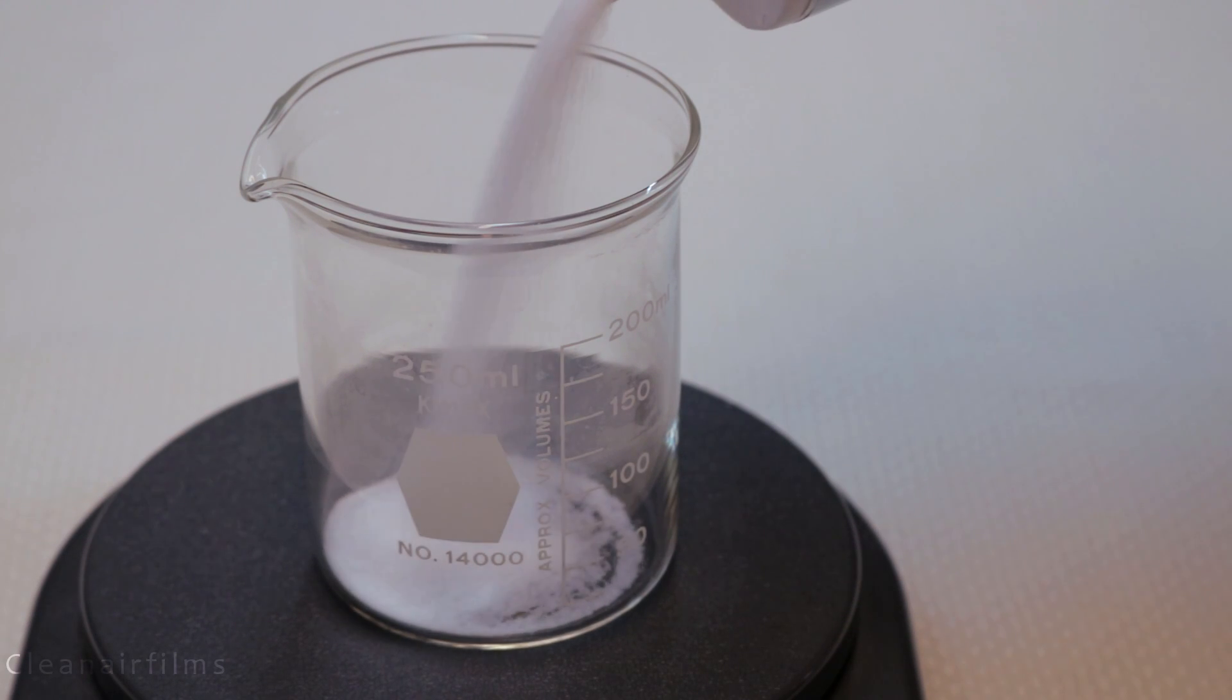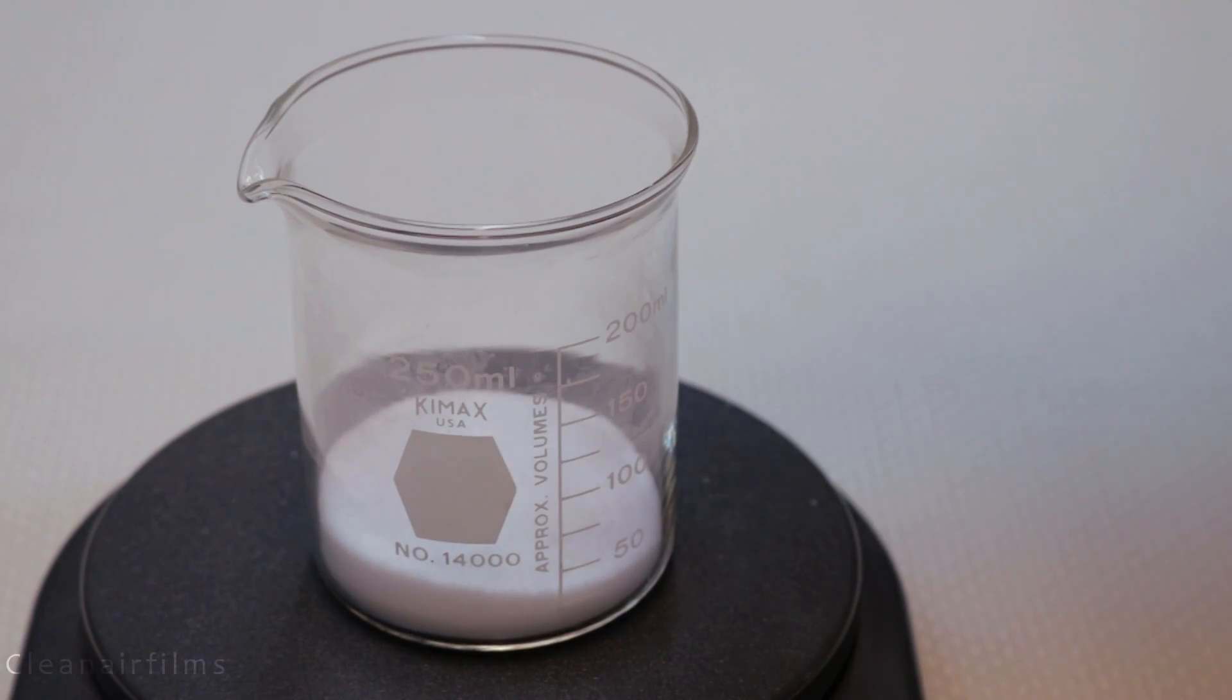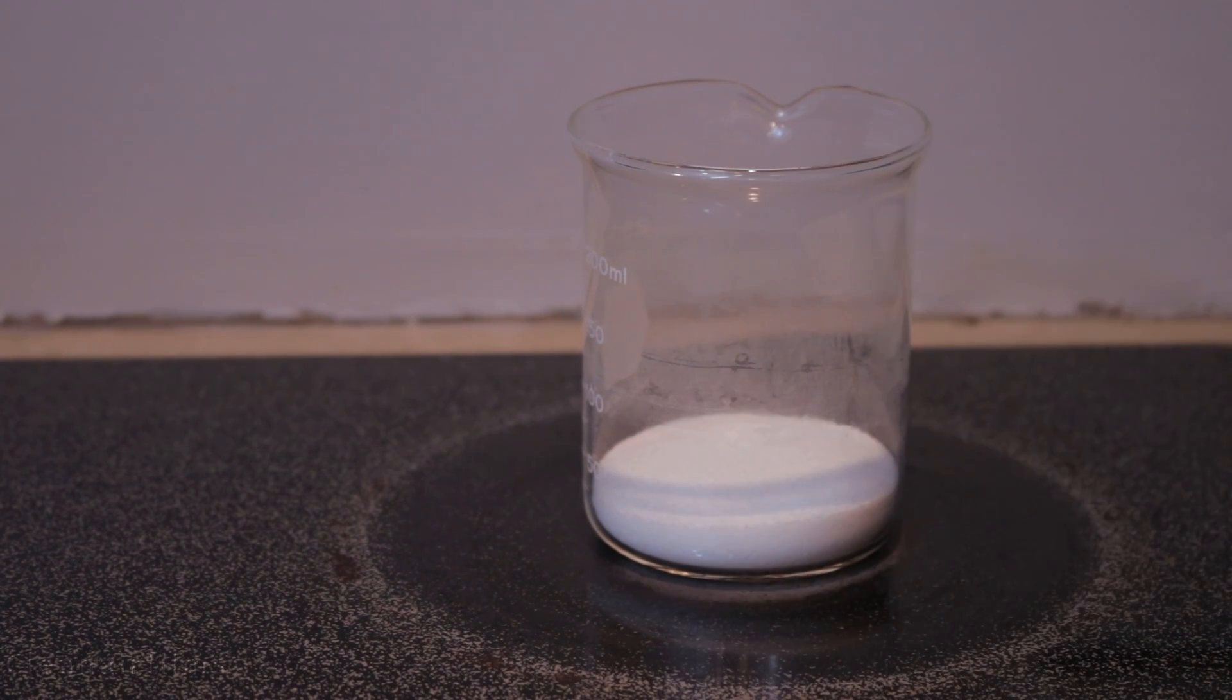First add 50 grams of salt to the beaker. Now measure out 50 milliliters of water into the graduated cylinder. Put the beaker on the stove and add the water.